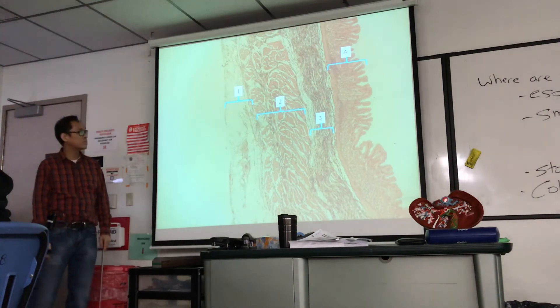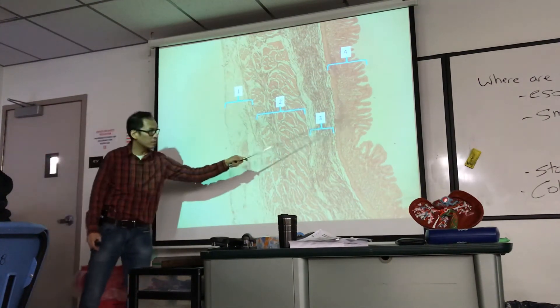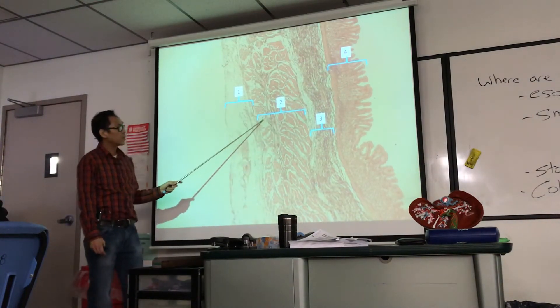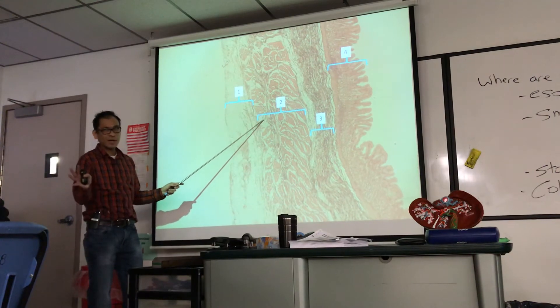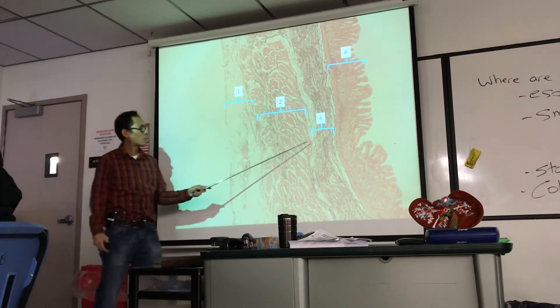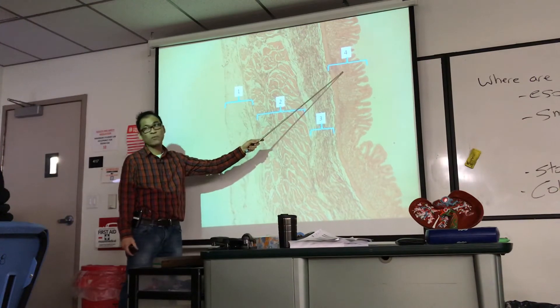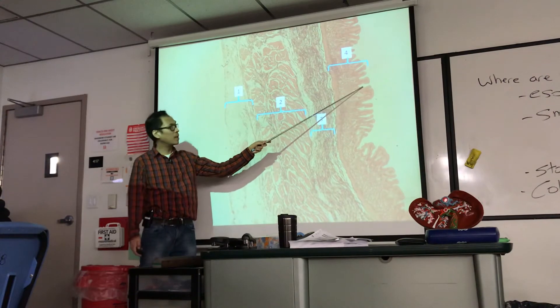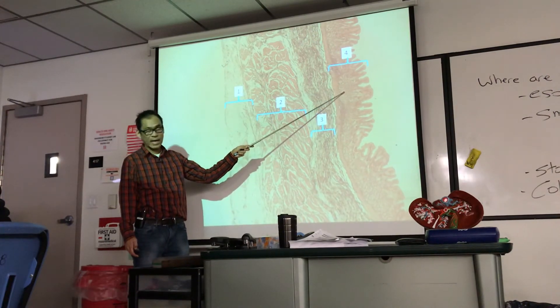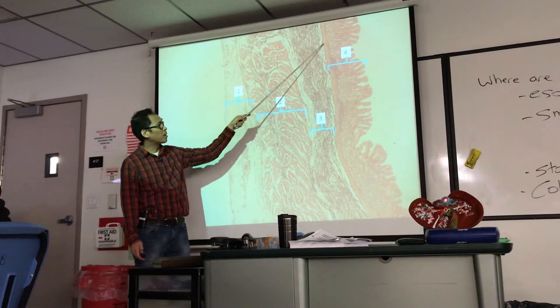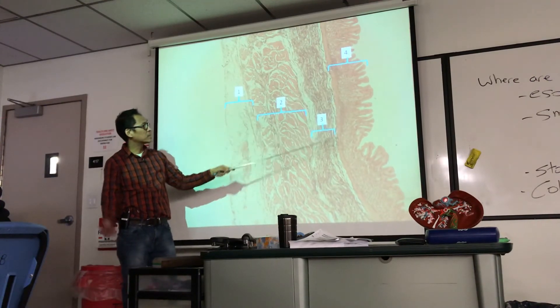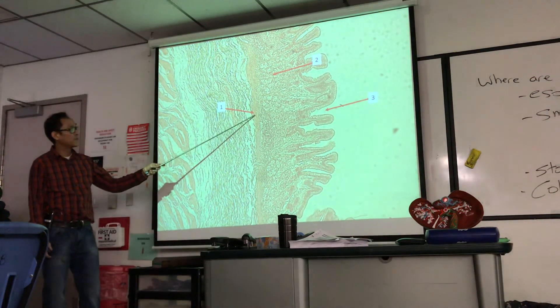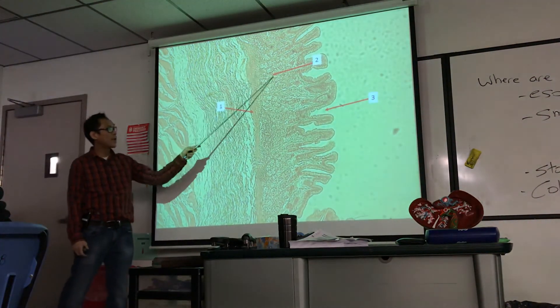Going from outer to inner, starting with number one: serosa. This is all muscularis externa — there are three layers in there, but I can't make them out, so don't worry about it. Number three: submucosa. Number four: mucosa. On this picture, if it's a pit, call it a gastric pit; deeper in the mucosa, it's a gastric gland. That pink there is going to be muscularis mucosa. So: muscularis mucosa, gastric gland, gastric pit.